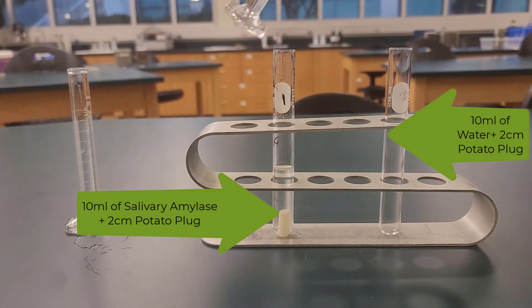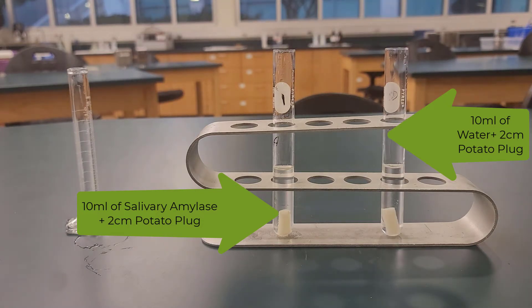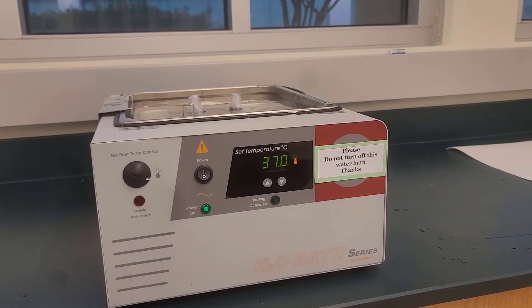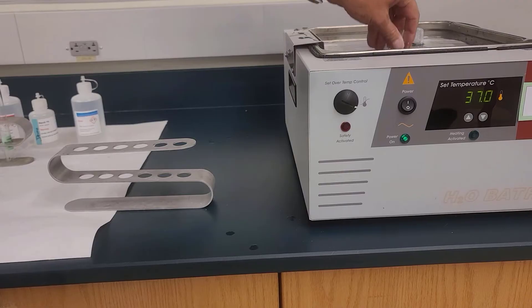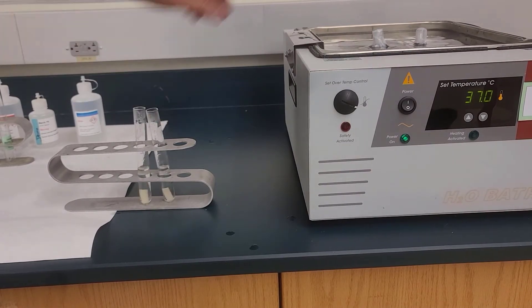We're going to place both of those tubes in a 37 degree Celsius water bath for about 20 minutes. After about 20 minutes, we take them out and we add to both tube one and tube two two milliliters of Benedict solution.